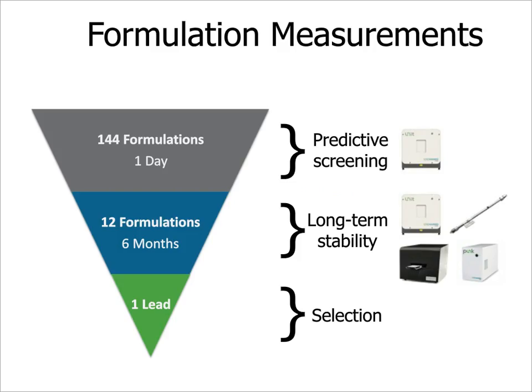So I wanted to describe to you an experiment that we have done at Unchained Labs in-house, where we've looked at a monoclonal antibody which we were kindly gifted by a commercial partner. And we wanted to see whether or not experiments and measurements that we obtained were predictive of long-term stability.